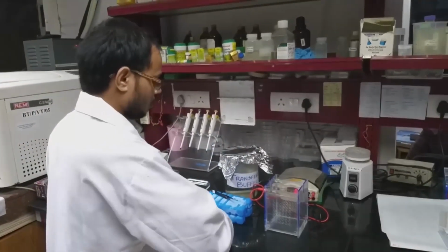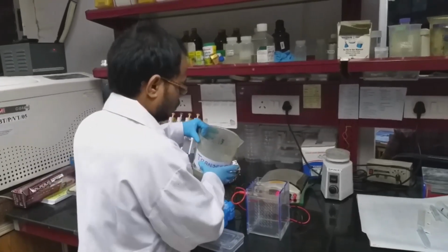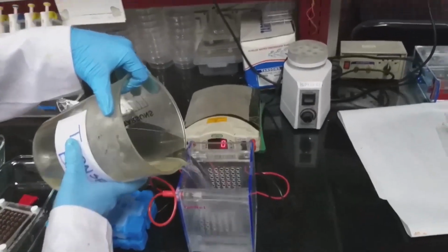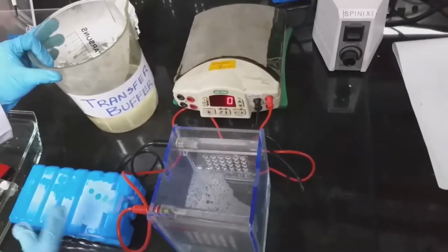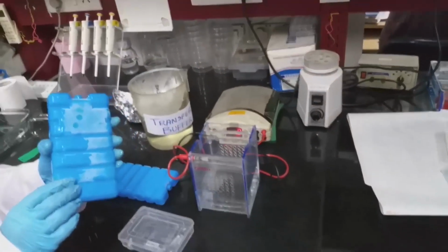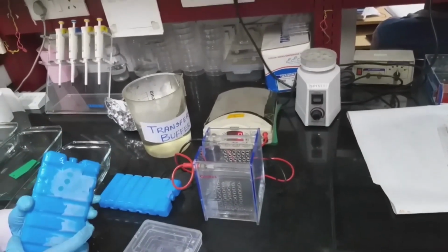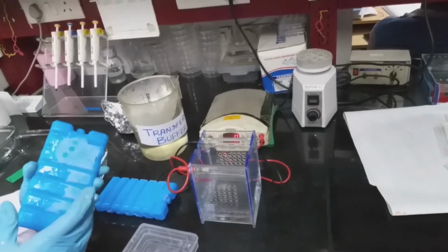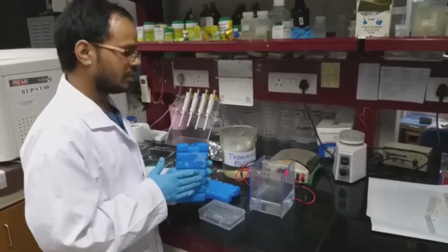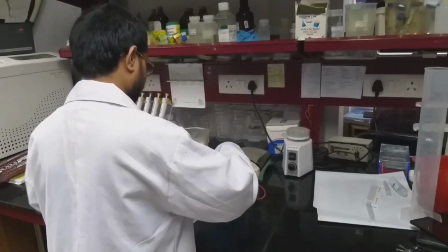Now we are going to do the transfer. Pour sufficient buffer. Keep this ice pack also. If the chilling is not sufficient, then there may be heat generation. In order to prevent that, we will use this ice pack. This will keep the buffer cool until the end of the transfer.